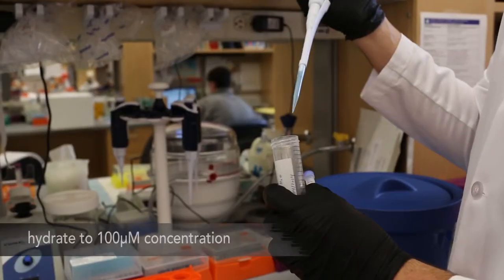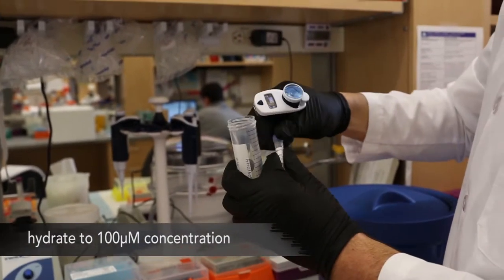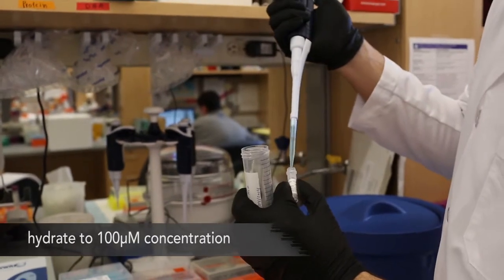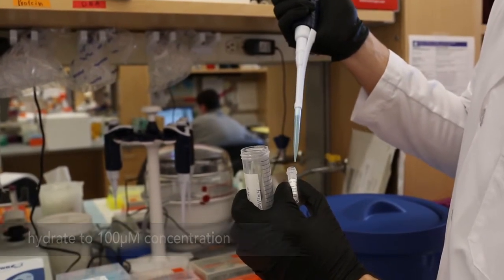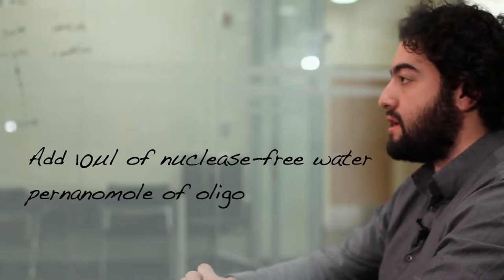To hybridize the 121 oligonucleotides to the scaffold, we will first need to hydrate the provided oligos with nuclease-free water to achieve a total oligonucleotide concentration of 100 micromolar. You will want to add 10 microliters of nuclease-free water per nanomole of oligo.